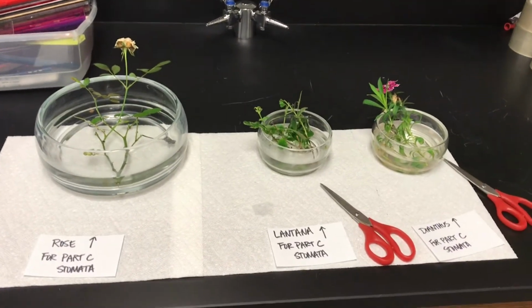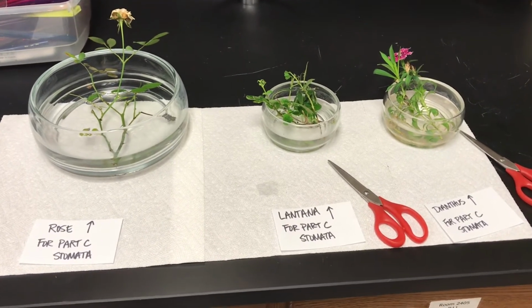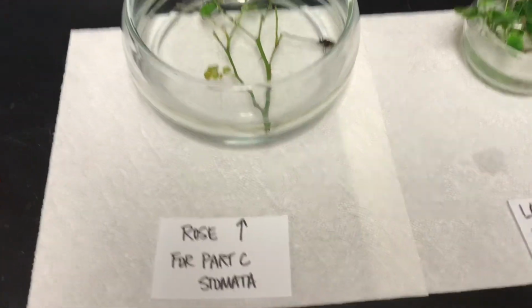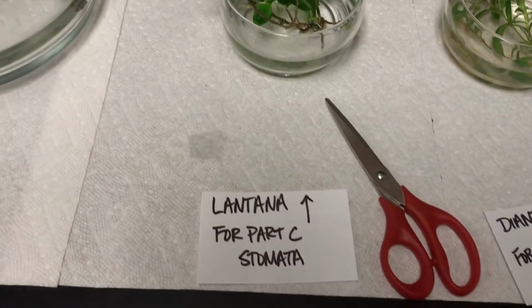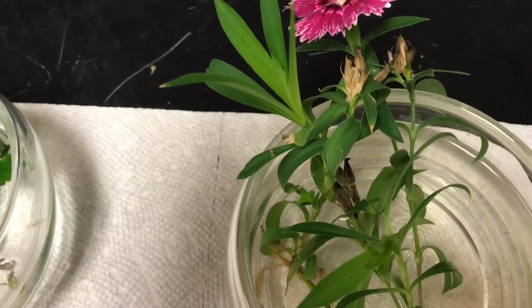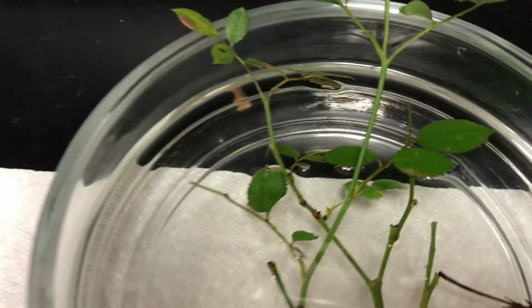Okay, so this is part C of the AP Photosynthesis Lab. This is the stomata exam. So we're going to be examining the stomata of 3 different species of plants here from Kingwood, Texas. The first one is rose. I have these stored in water to keep them fresh. This one is lantana. You can see what they look like. Leaves look a little different. And then this one is dianthus, which has little short leaves and some pretty flowers. Okay, so dianthus, lantana, take a look at that, and then rose.